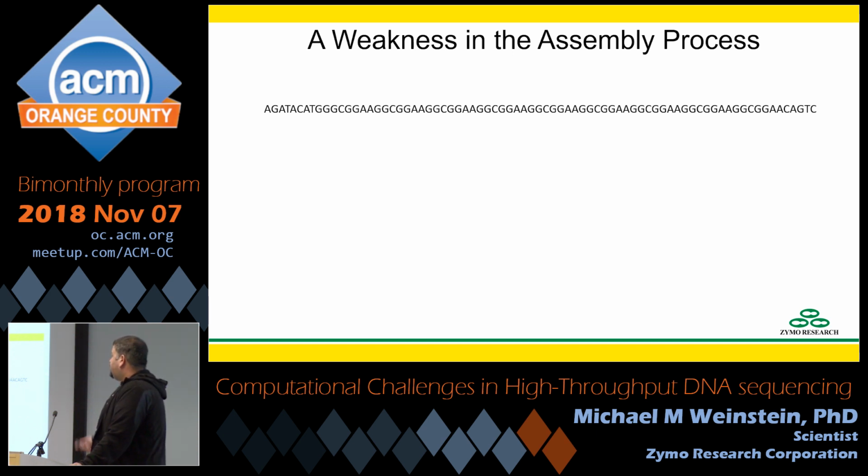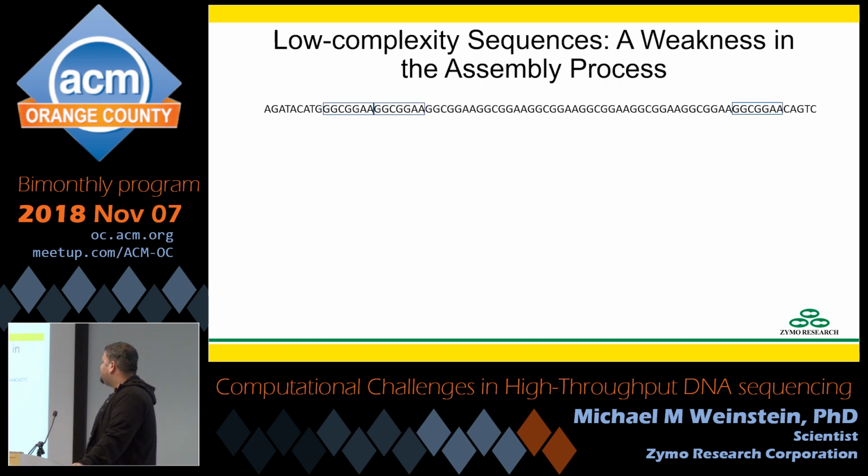So there is a weakness in the assembly process. Looking at this sequence here, I'm going to highlight these.